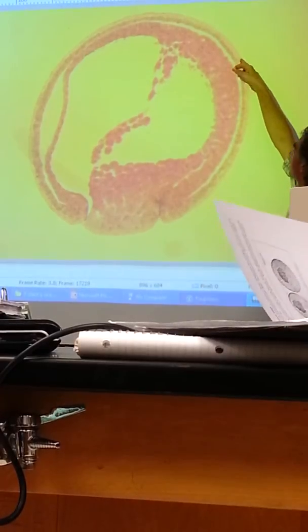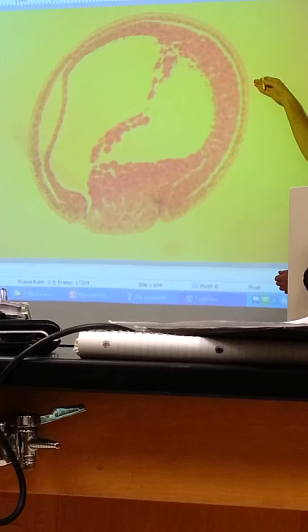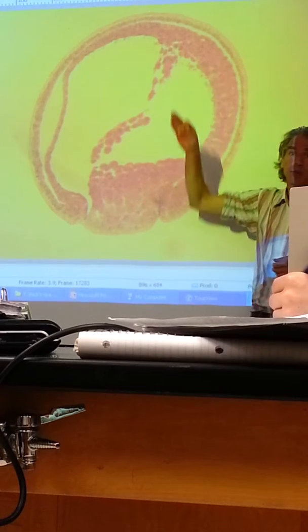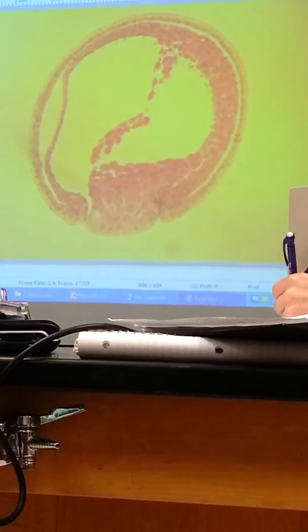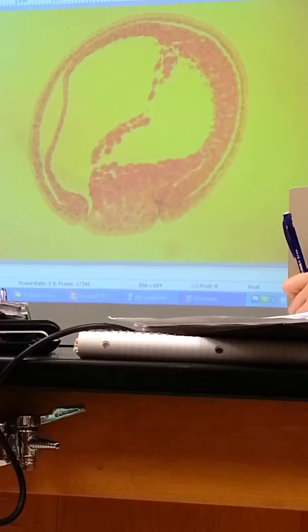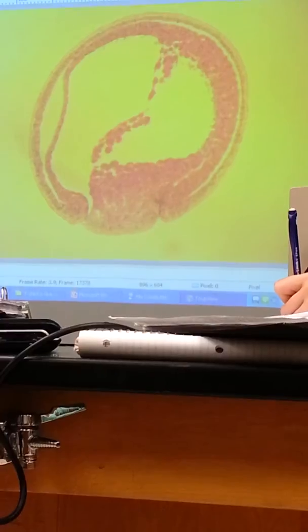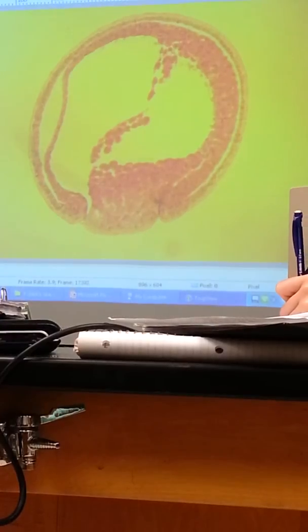You're seeing a layer of cells out here with very small nuclei. Small cells out here. That means that they came from the animal pole. As the cells of the animal pole continue to divide and push against each other, they're pushing cells down around the vegetal pole. The animal cell poles are dividing faster than the vegetal cell poles, and they start to migrate downward around this.